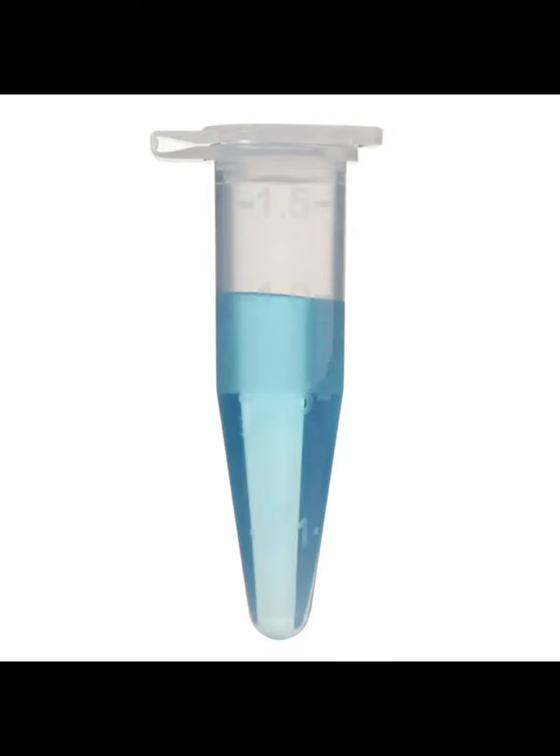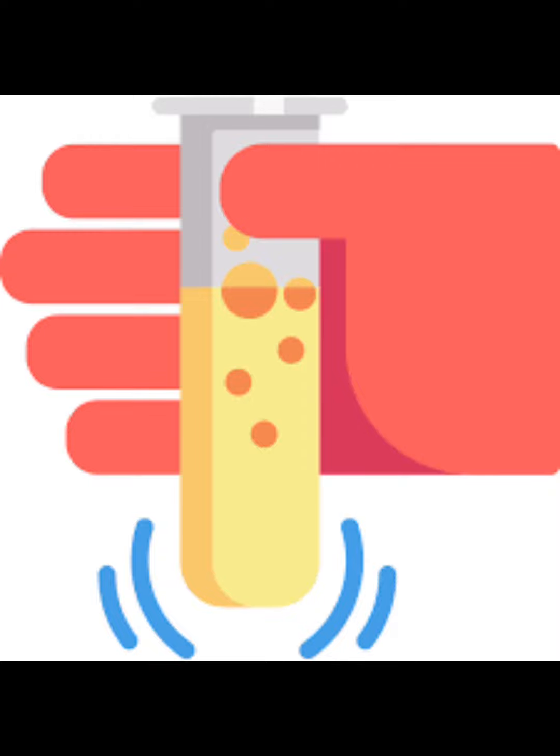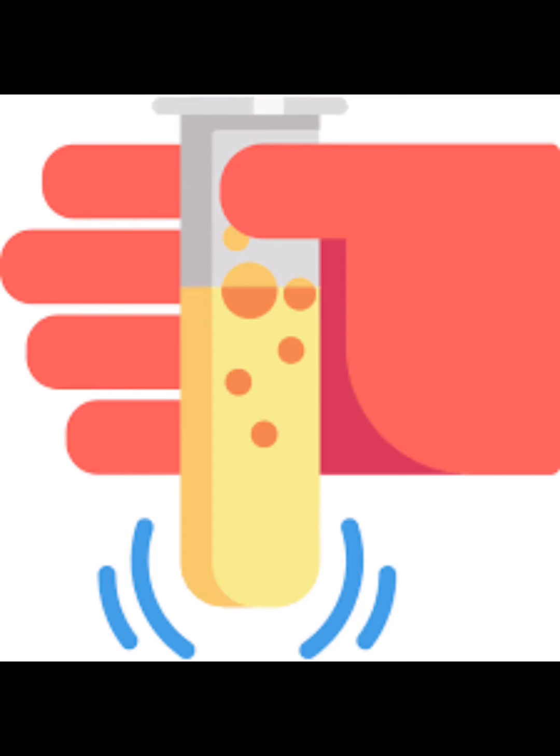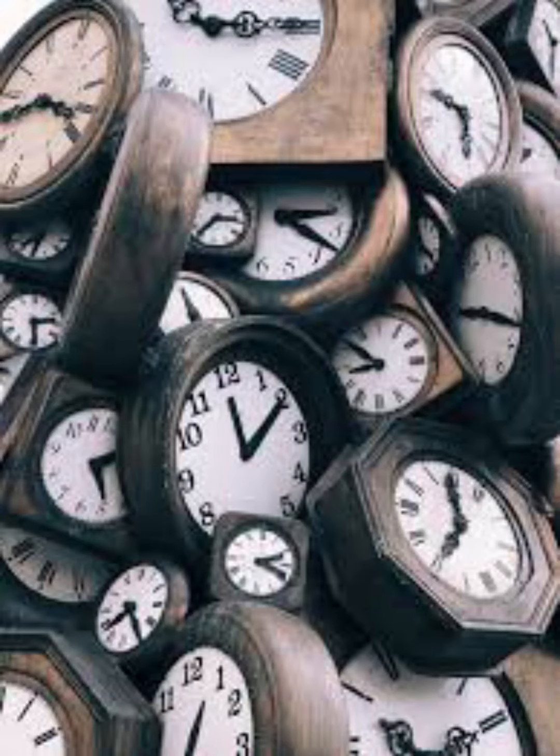Use a pipette and fill one of the LB media microcentrifuge tubes almost full with roughly room temperature water. After this, shake the tube to dissolve the LB media. Now, add roughly half of this LB media solution to your competent cell mixture and gently mix it by flicking the side of the tube. This next step is probably the most important step of the entire experiment.